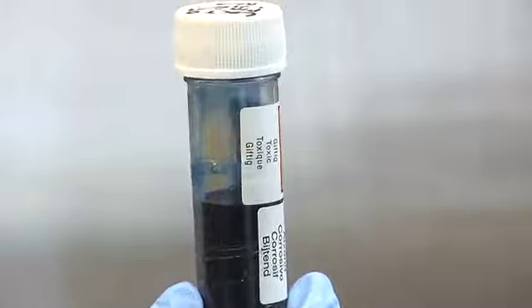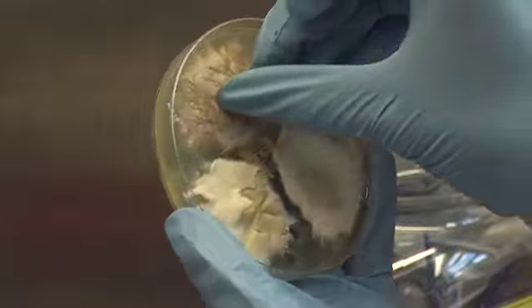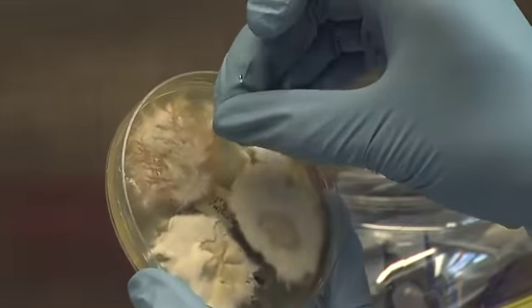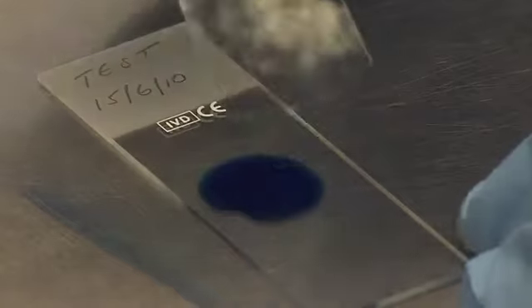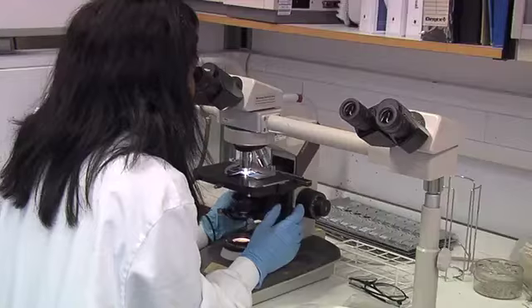To identify this isolate, a lactophenol cotton blue sellotape preparation needs to be made. A piece of sellotape is used and pressed onto the colony surface to pick up the fungal structures and spores. The sellotape is then transferred onto a few drops of lactophenol cotton blue on a glass slide. This preparation is then examined under a microscope using the ×40 objective. The slide is examined for the arrangement of the hyphae, the presence of small unicellular microconidia, or the presence of large multicellular macroconidia.